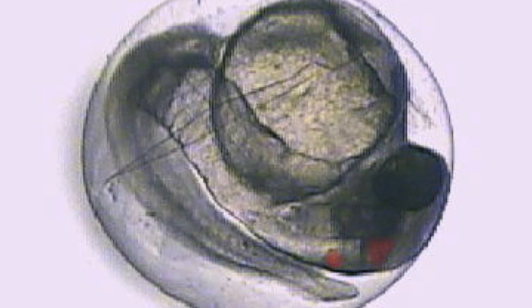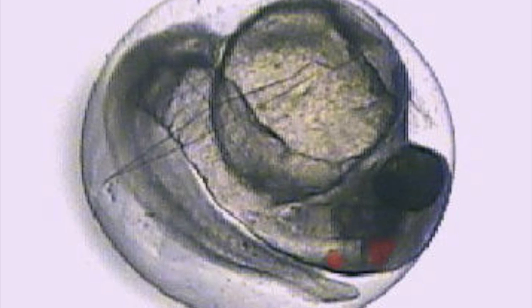In order to improve this experiment, more trials with more zebrafish embryos would have to be used due to the lack of quantity of zebrafish due to their high death rate within this experiment, causing redesign of the experiment throughout the process. Also, further research could include measuring the heart development of an actual fully developed zebrafish and its heart function so the full effects of cadmium can be observed.